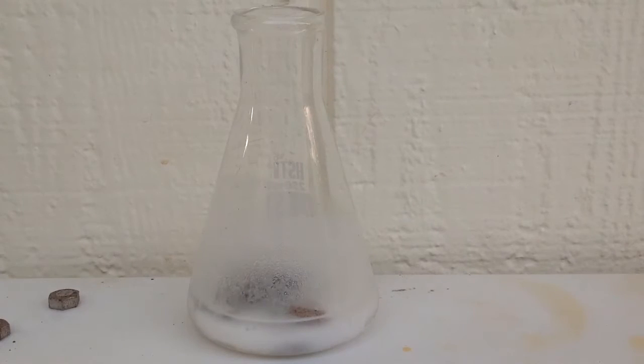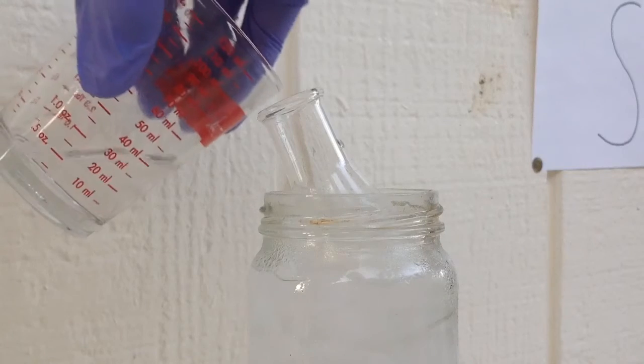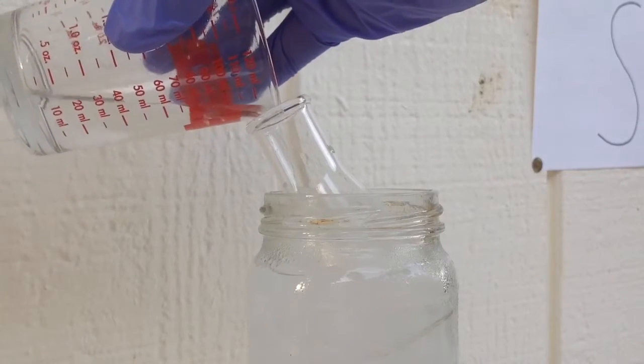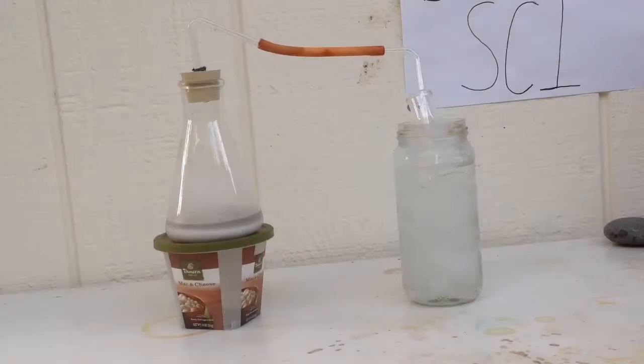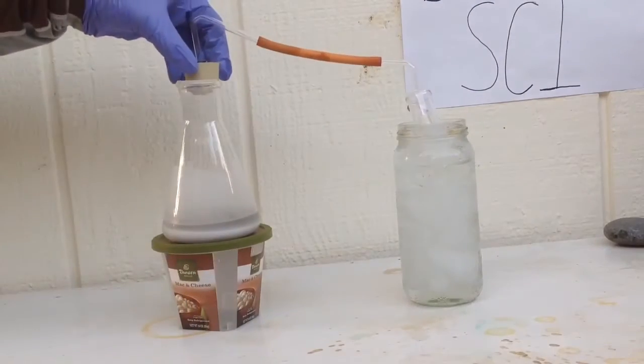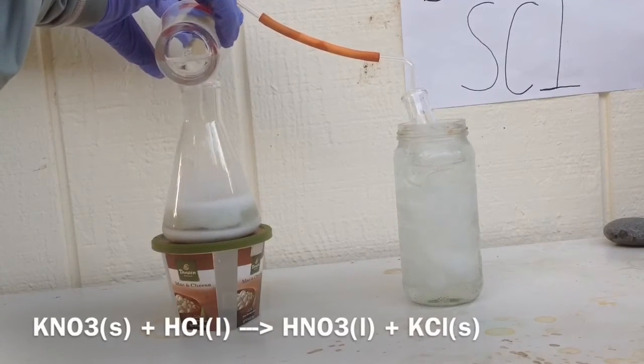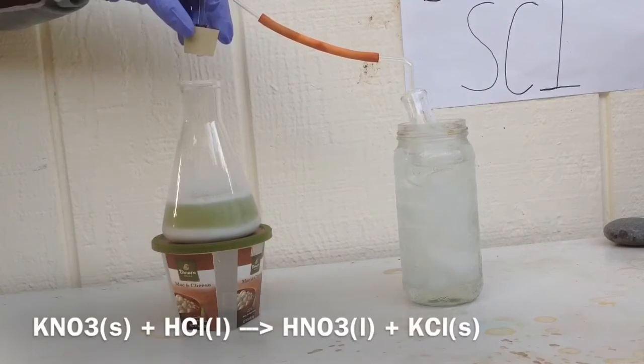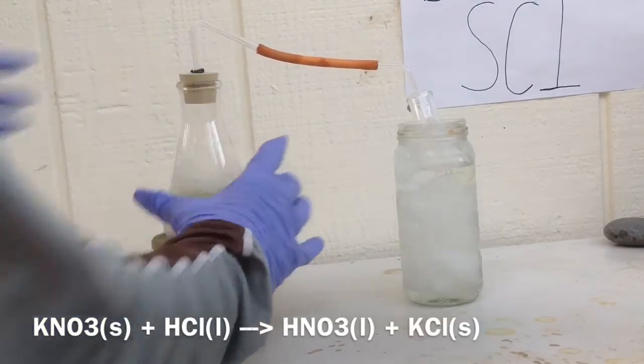Now add the 19 milliliters of hydrogen peroxide and add the hydrochloric acid.